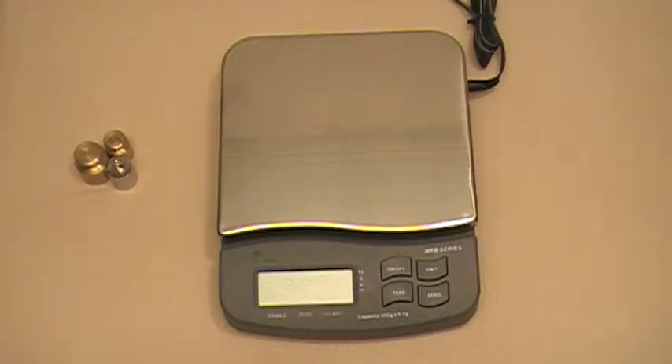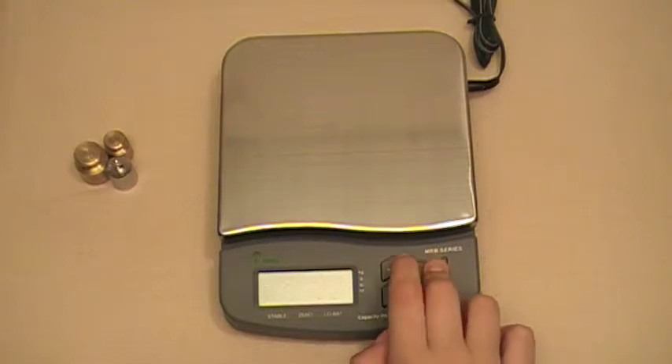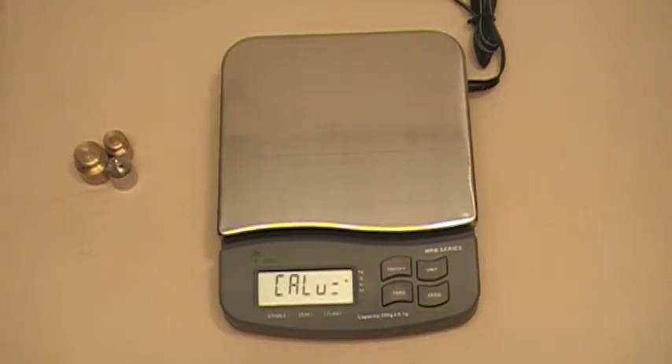This video is going to show you how to calibrate your MRB series compact scale. To do that, press the unit button and then press the on/off button, and that's going to bring up the calibration menu.